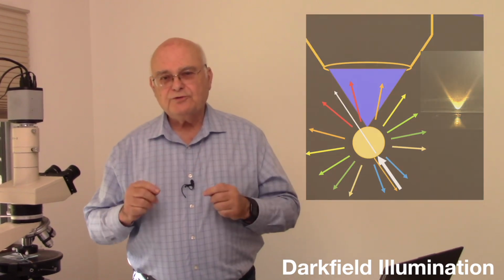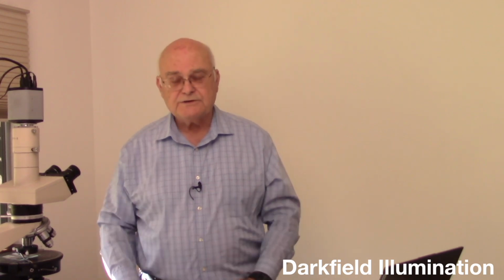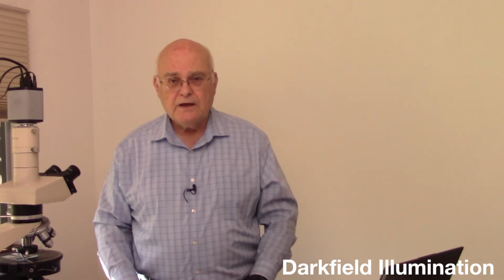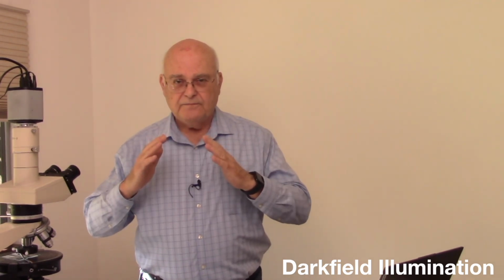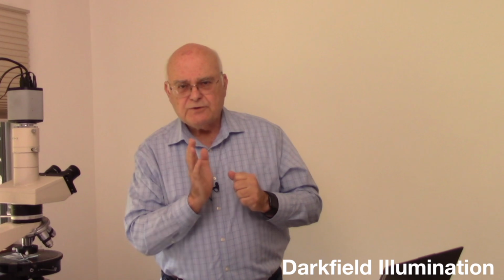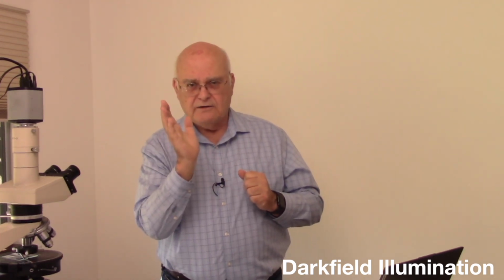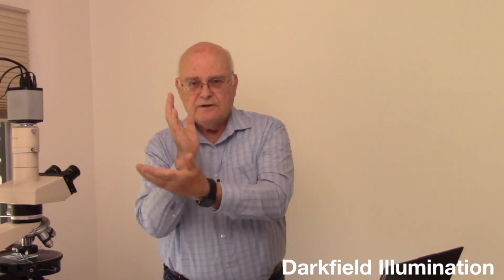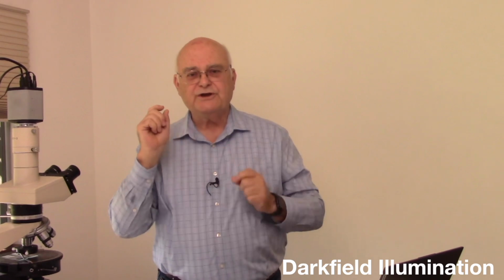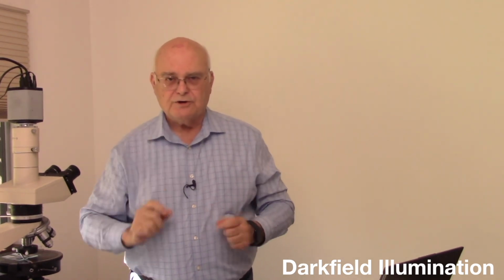Now, if we go to what's called the dark field stop on the turret phase condenser here, we're collecting now, instead of a narrow beam of light, the angle that isn't quite collected by the objective, and then we have all of the angles out here. So it's not a very narrow angular exposure.